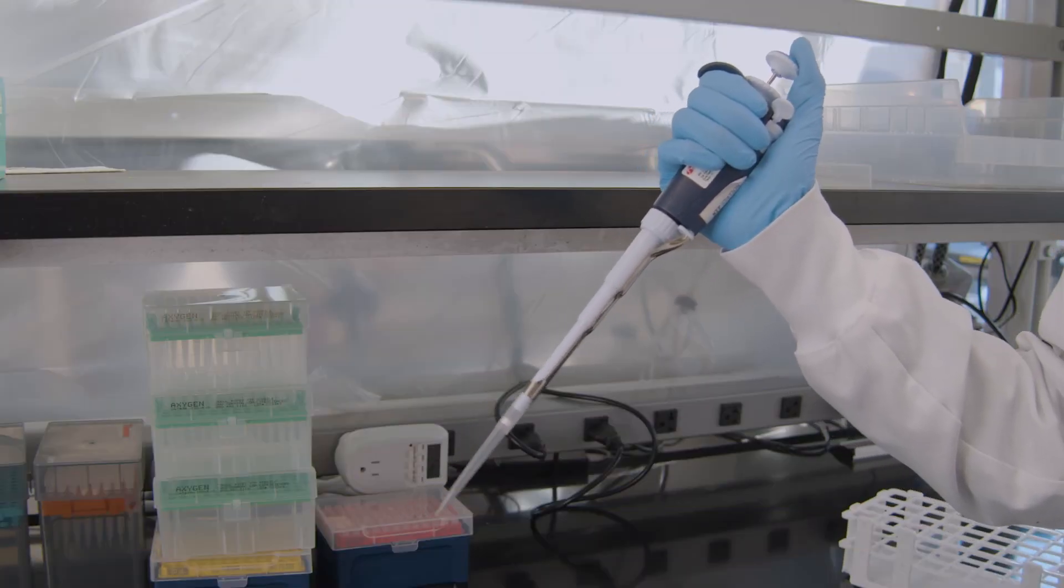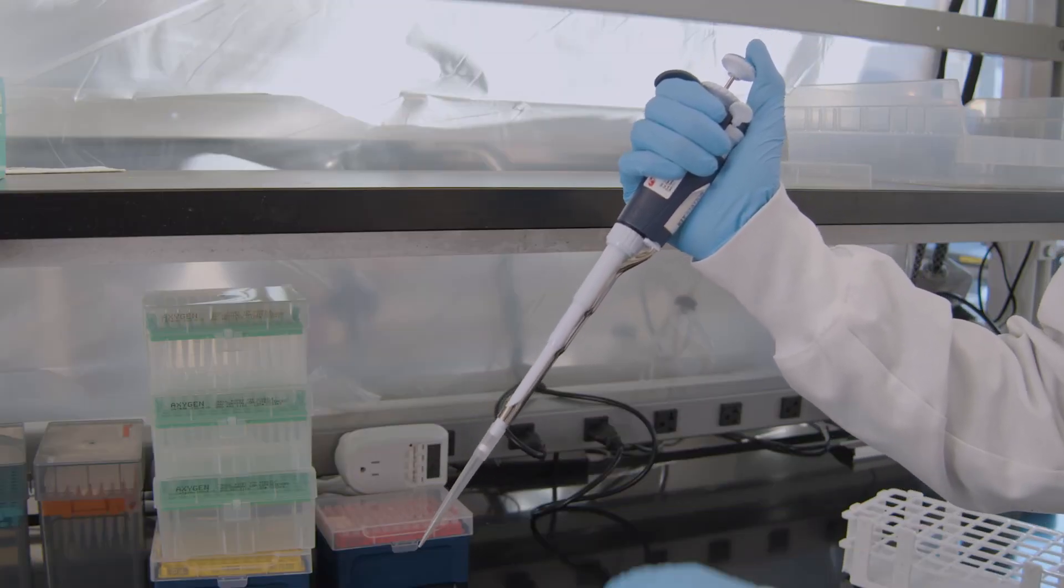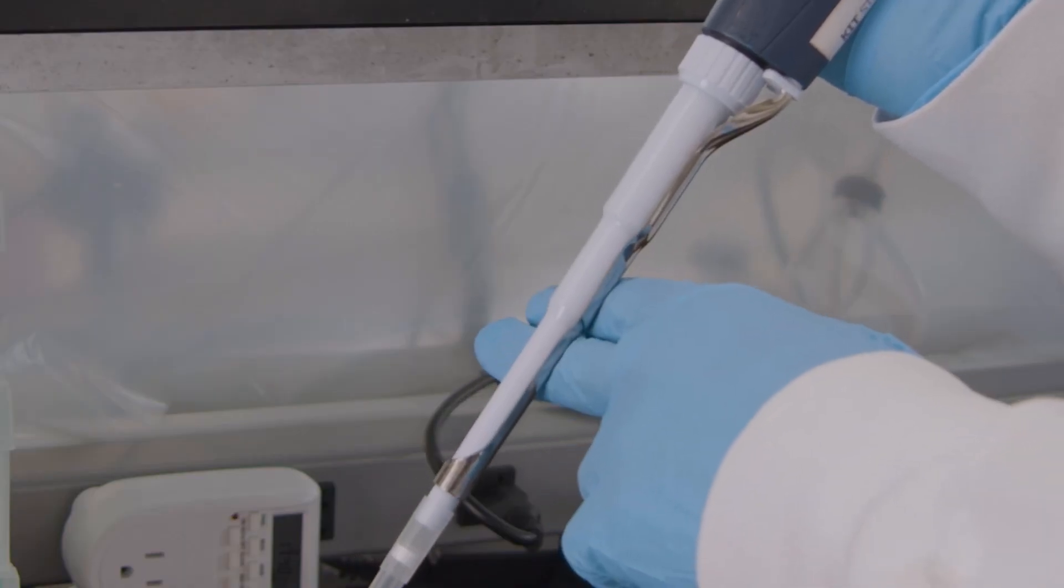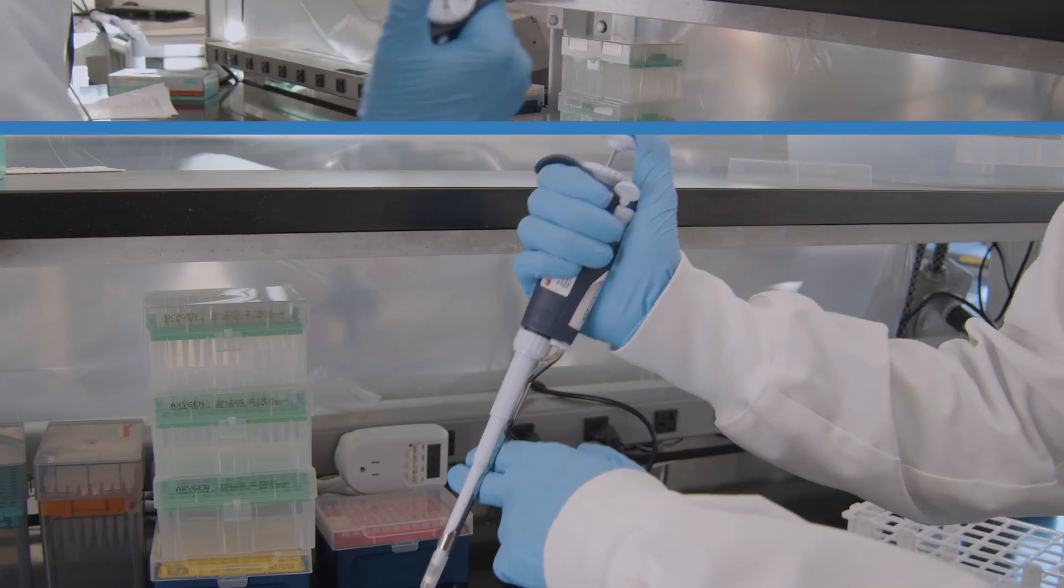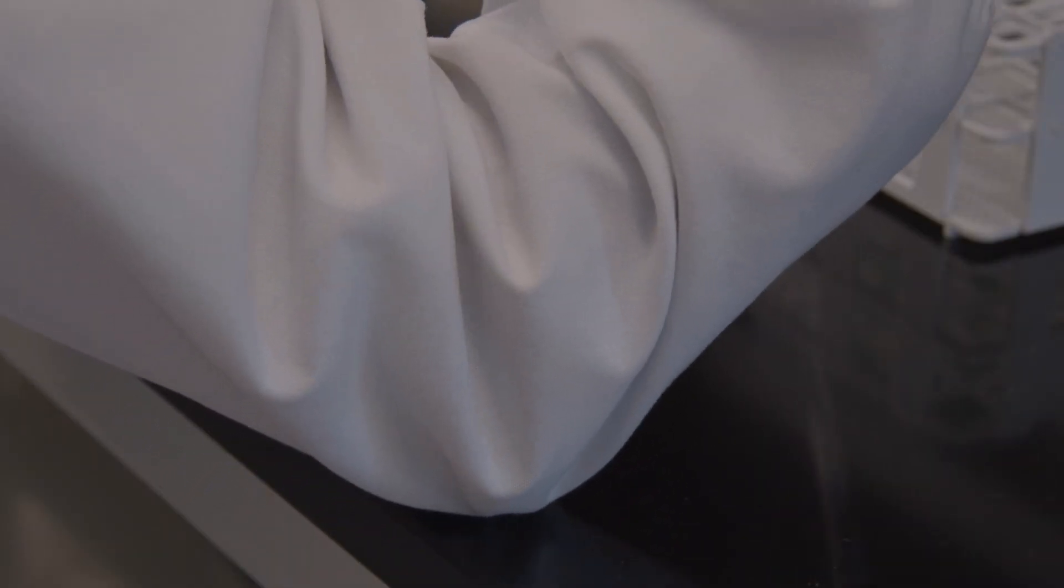If you're struggling with hand steadiness or accuracy, try putting two fingers on the pipette for support. You can also rest the elbow of your pipetting arm on the bench for added stability.